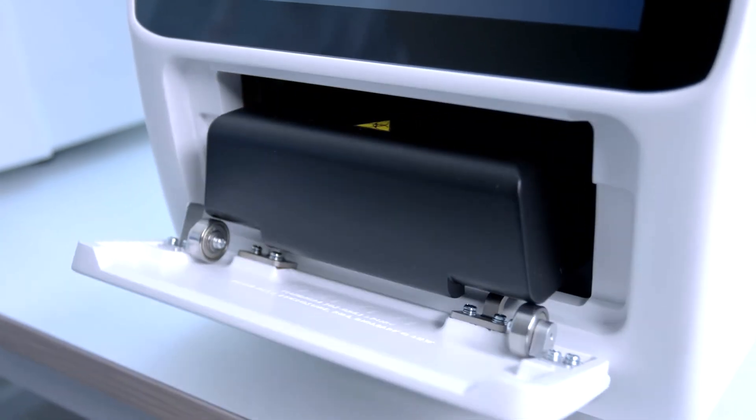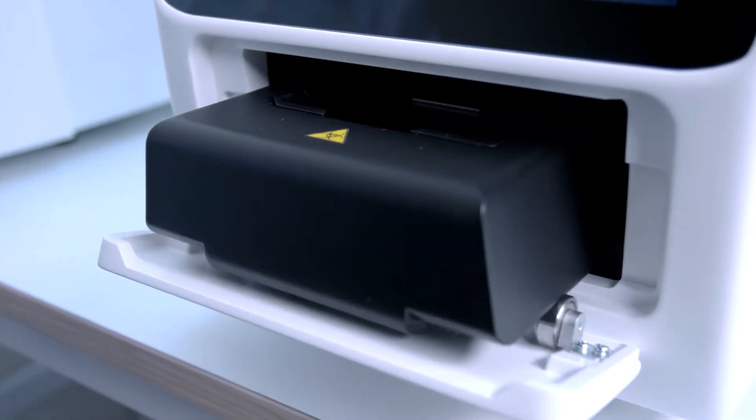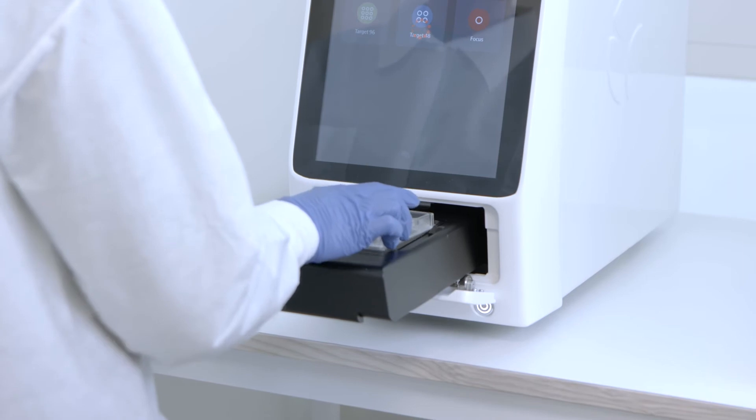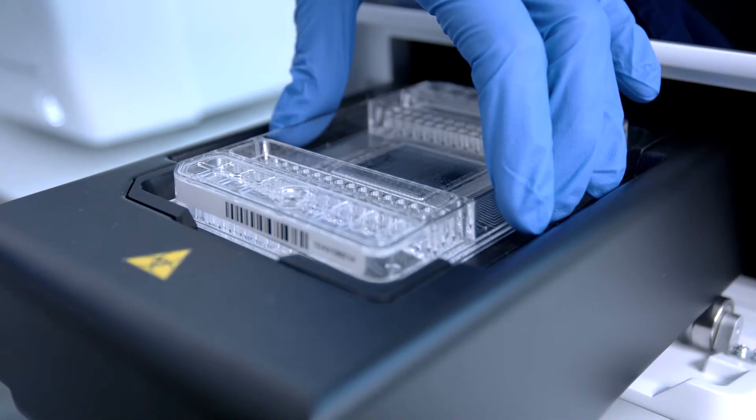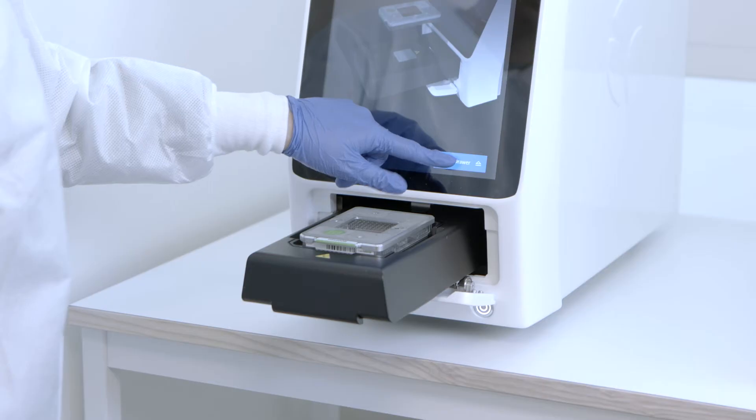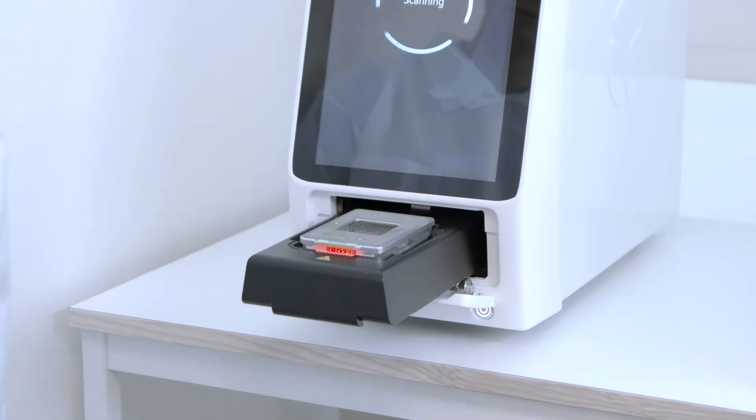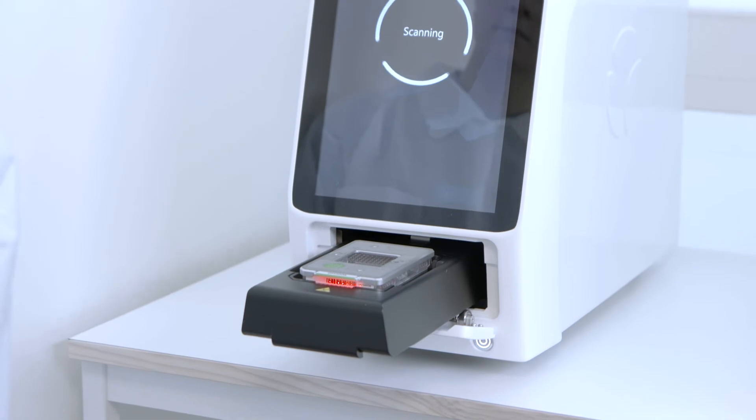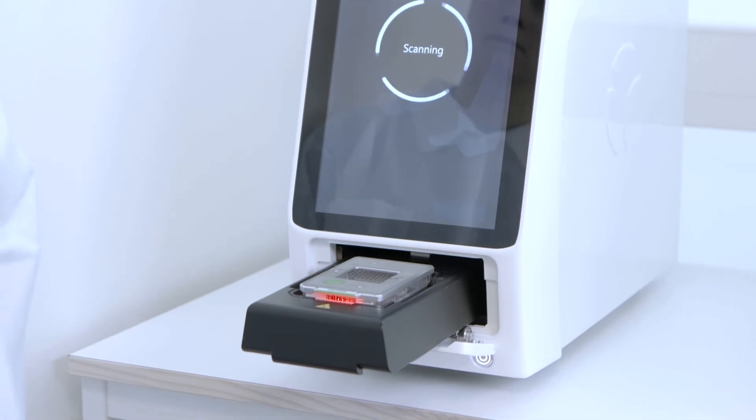Sample analysis takes place on an integrated microfluidic cartridge, or IFC chip, which is loaded into the IFC reader at the bottom of the instrument.